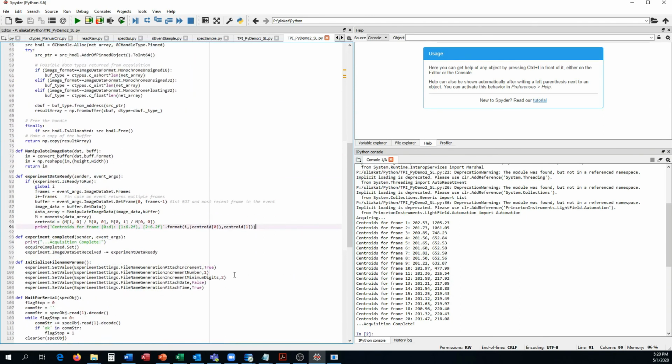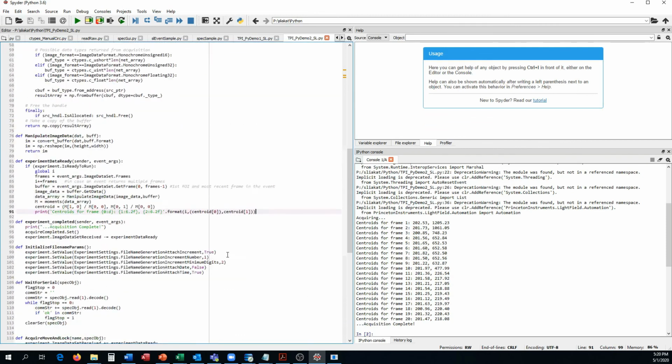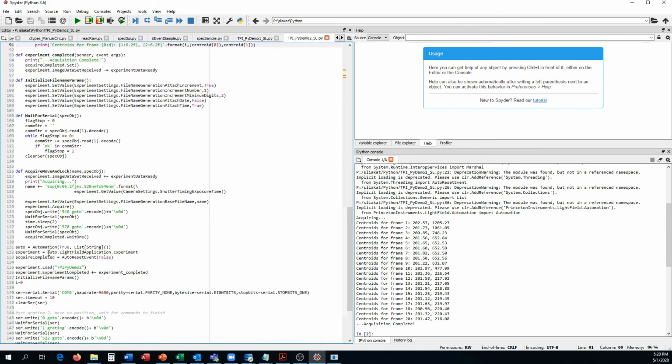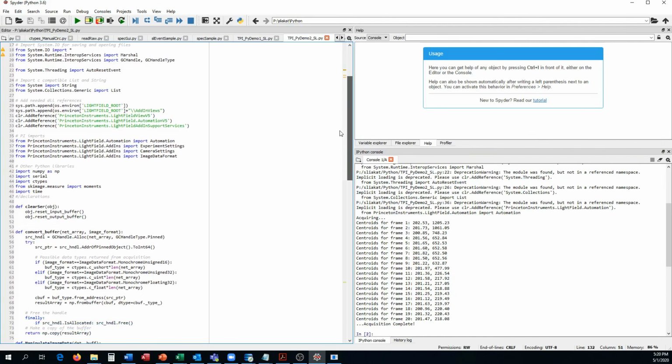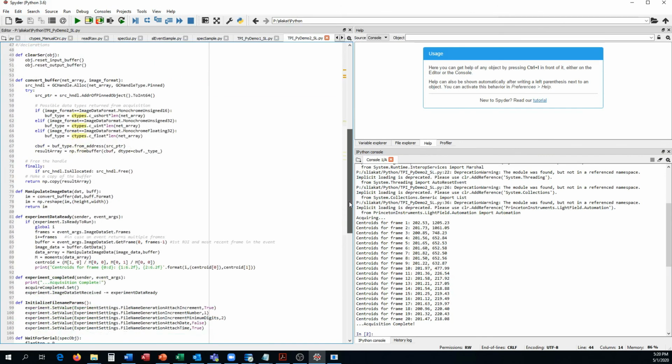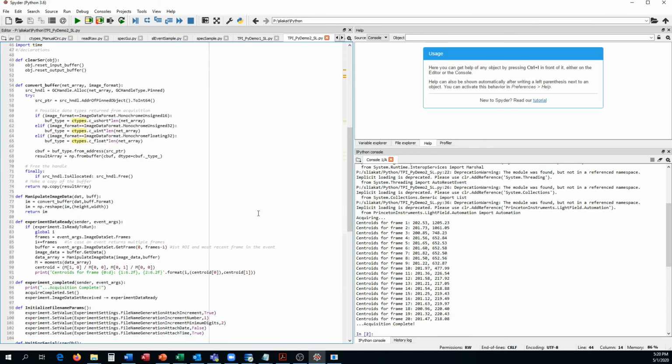And you can see how easily you can just import a few Python libraries, and you can do things like serial command. You obviously have the .NET control with LightField, and now you have the math power. You have NumPy to transform the data into a Python array, and you could see I did all of this as a 2D array, and it was fast enough.